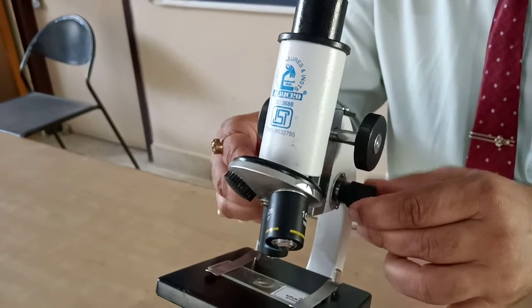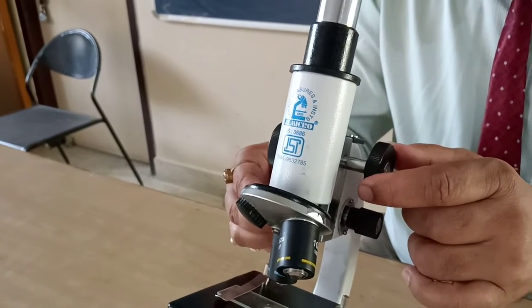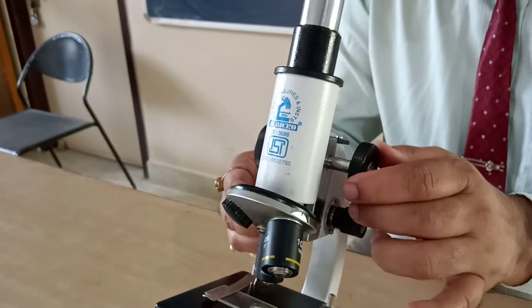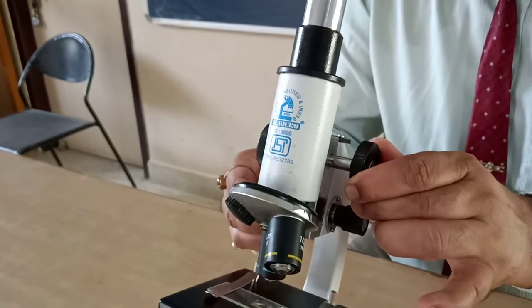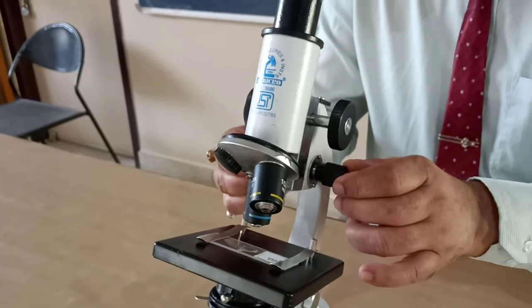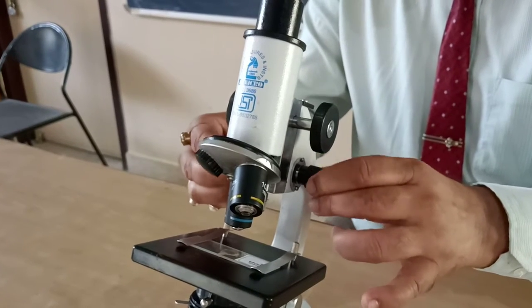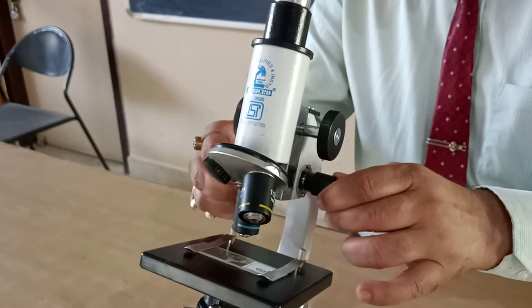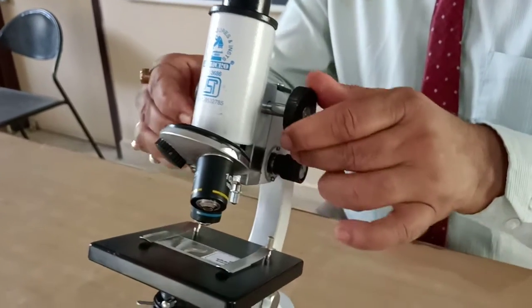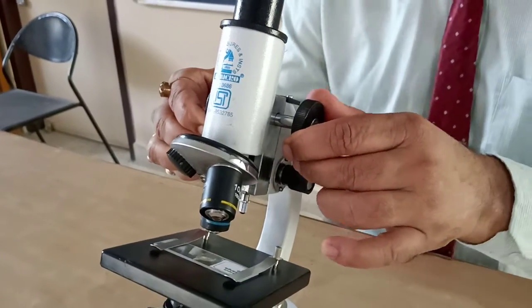This is for fine tuning of the object. First of all, we have to use the broad one. This can roughly set the slide, and we can see the object. Roughly the object is almost clear, but if we wish to make it more clear, then we have to use the fine adjustment screw. This moves the body tube also, but very slightly. You cannot visualize that movement, but you can visualize the movement of the broad adjustment screw very easily. Now let me see the multiple lenses.